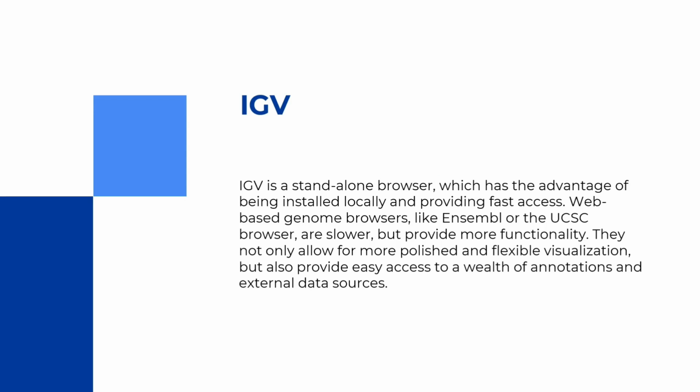Web-based genome browsers like Ensembl or UCSC browser are slower but have more functionality. They not only allow polished and flexible visualization, but also provide easy access to a wealth of annotation and external data sources.